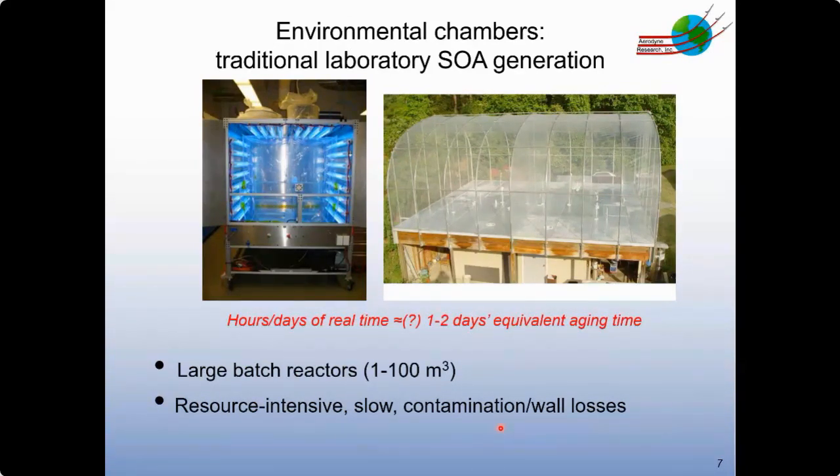These are the most established method for laboratory SOA generation. They've been used for a long time, and they're widely accepted around the world as the most common means to do this. So they have a lot of advantages, and a lot of great research has been done with them, but they have some disadvantages that sometimes limit their applications in practical situations, including some that I've summarized in this bottom bullet point here, that in general, chambers, because they're so large, are extremely resource intensive to maintain.